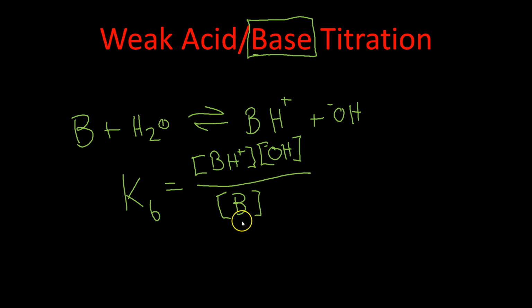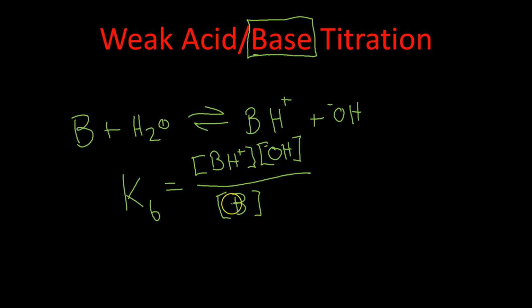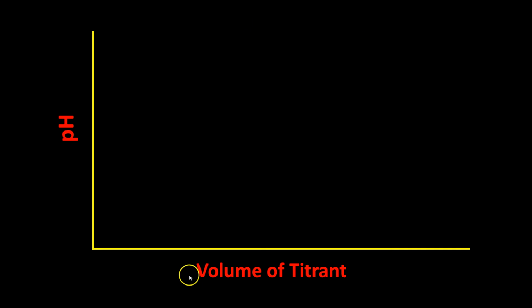Just so you know, when we're titrating, the H+ that we're adding is reacting with excess base, excess hydroxide, and neutralizing it essentially. What we're going to do in this experiment is a little different than before, where we used an indicator. In this case, we're going to do something called potentiometric titration. We're going to be monitoring pH as we titrate, and you'll find this gives a much more accurate and precise measurement.